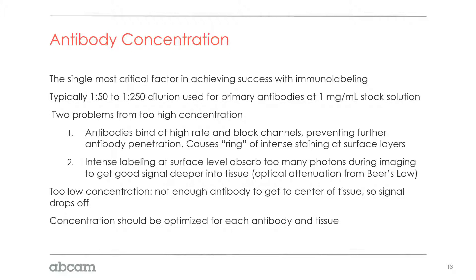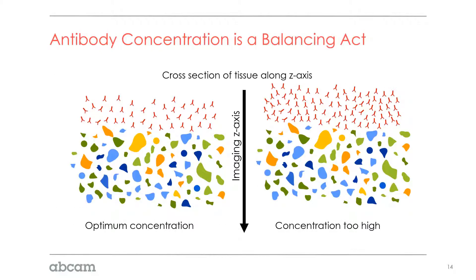Antibody concentration is really important. If we go too low, we won't get enough signal. If we go too high, we'll get signal only on the exterior of the tissue because the antibody blocks itself from penetrating in. Going too high can cause a dense ring of staining around your tissue, whereas going too low means you simply won't detect enough signal. It's a fine line between getting lots of signal and getting your antibody throughout the tissue.